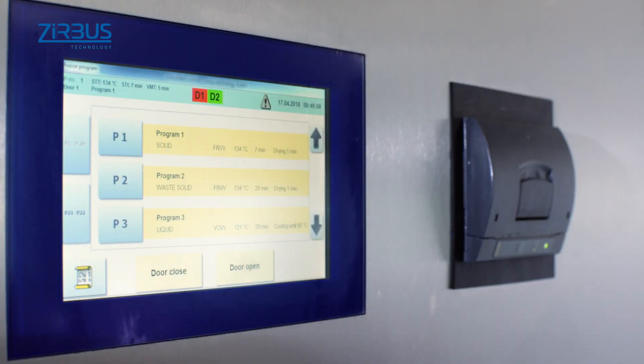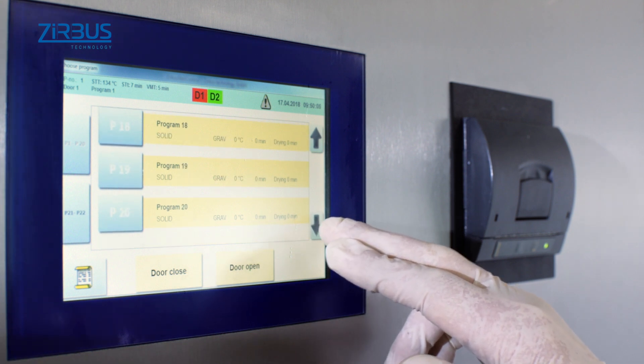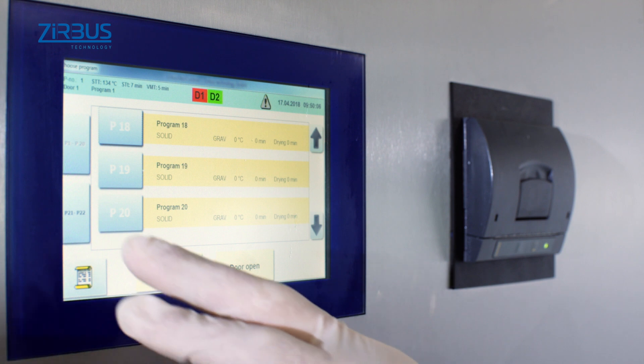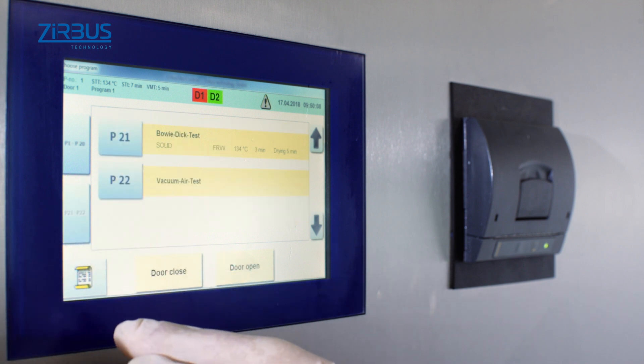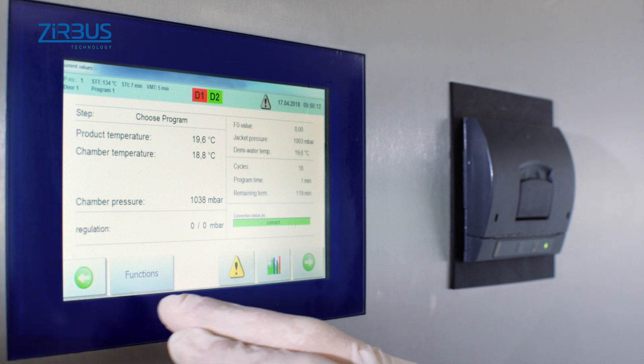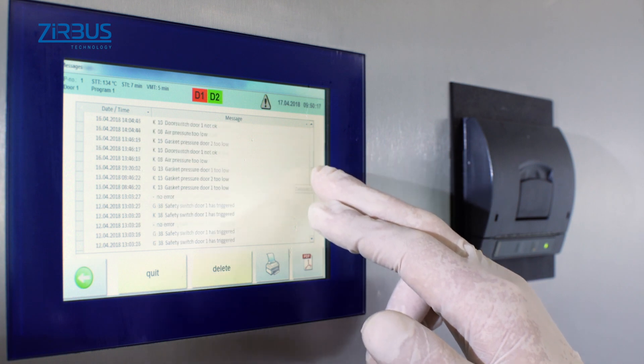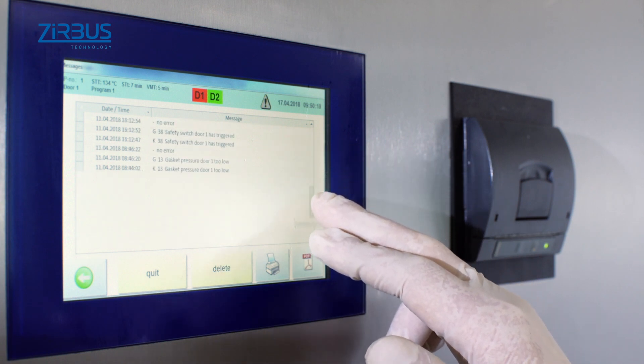A standard 7-inch touchscreen display with 20 fully customizable program channels serves as the user-friendly interface. The sterilizer can also be controlled from an industrial PC for additional functions such as process visualization, independent documentation, and up to 99 program channels. The unit can be operated externally using a laptop with a standard Ethernet connection, offering a convenient way to monitor sterilization processes from an office, for instance.